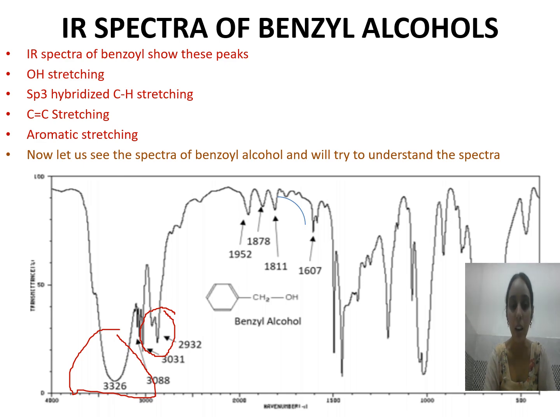This is the aromatic stretching or C=C stretching, and the C-O stretching comes in the fingerprint region. This is the C-O stretching.